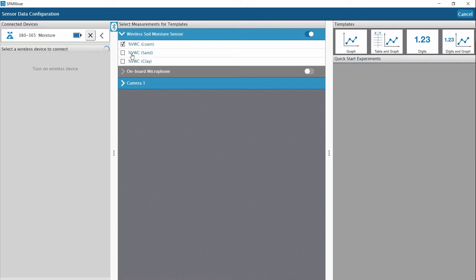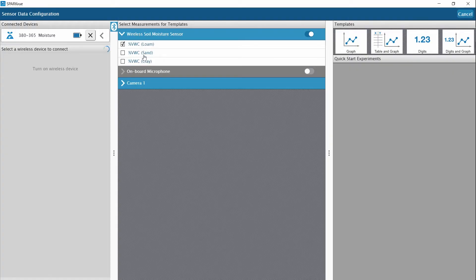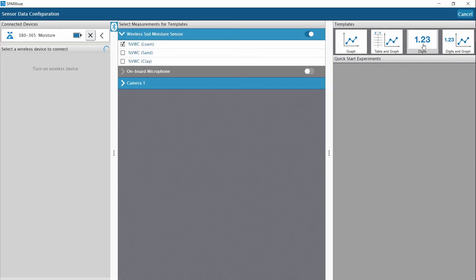The sensor works with either SparkView or Capstone software. I have already connected this sensor in SparkView. You will see that there are three choices for %VWC because different types of soil have different properties resulting in different VWC ranges. I'll be working with potting soil, so I will choose the low measurement. You can choose to display all three soil types if desired.